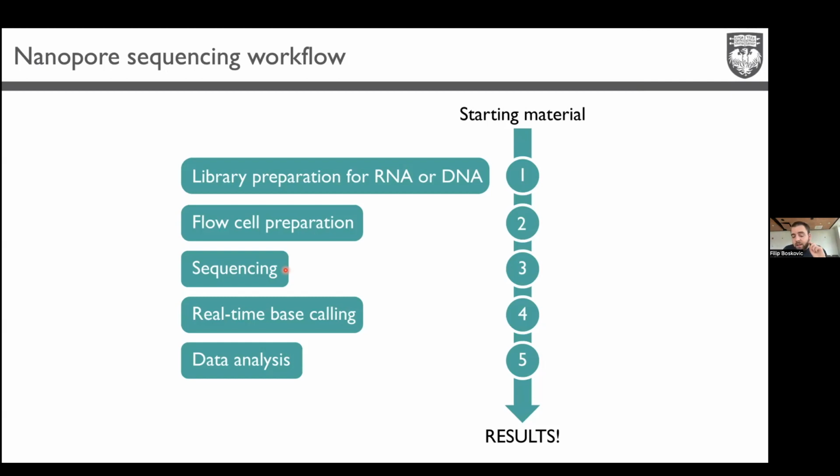You can just select it in the device and say, this is my reference sequence. If the nanopore is sequencing something that's not my reference sequence, just push it out. That increases your output. You get more of the data that you want, and you also finish your sequencing earlier than if you sequence everything that is inside.